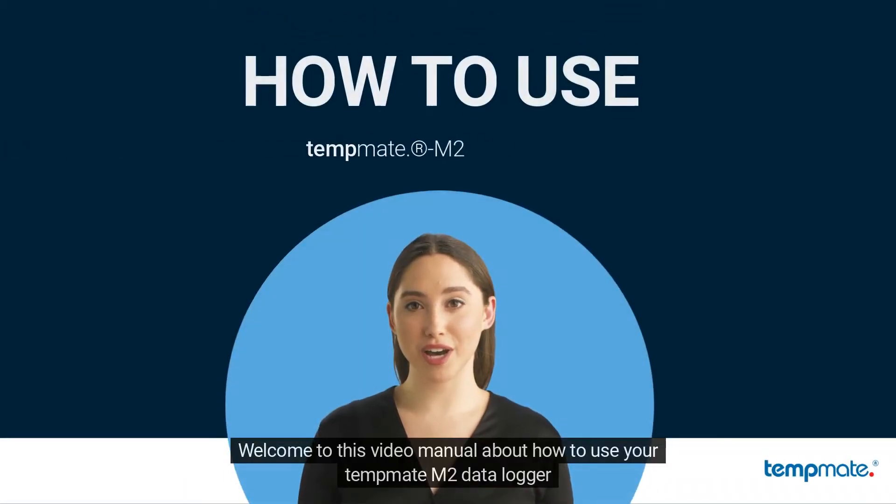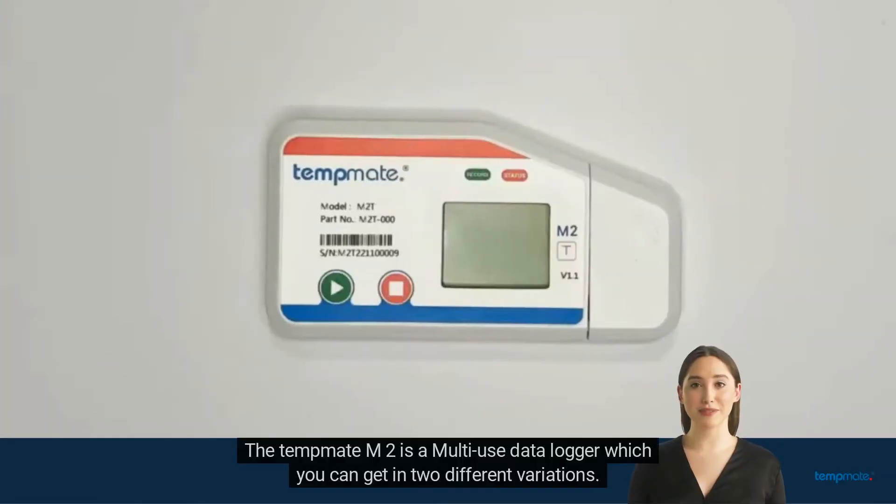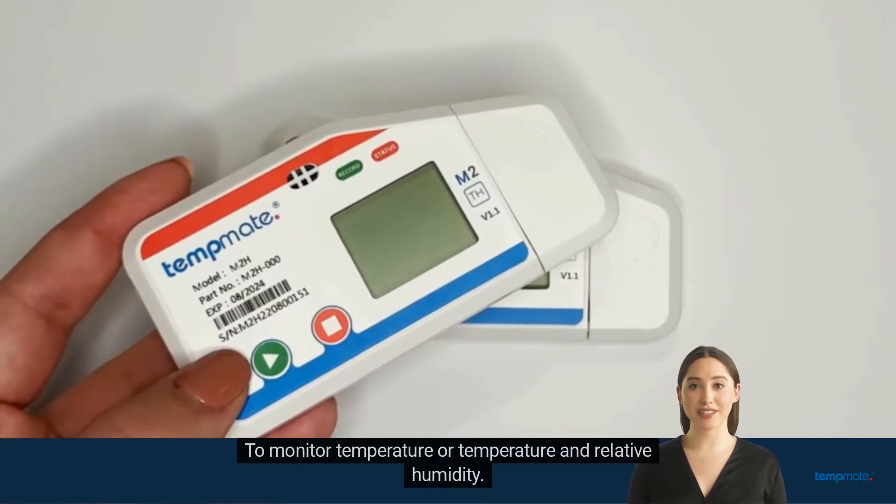Welcome to this video manual about how to use your Tempmit M2 data logger. The Tempmit M2 is a multi-use data logger which you can get in two different variations to monitor temperature or temperature and relative humidity.